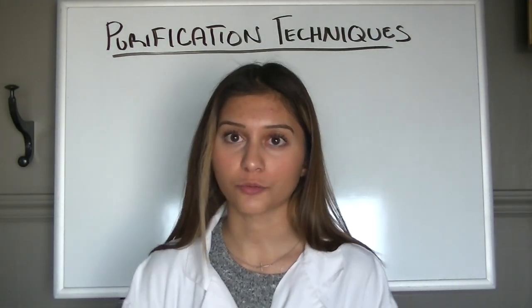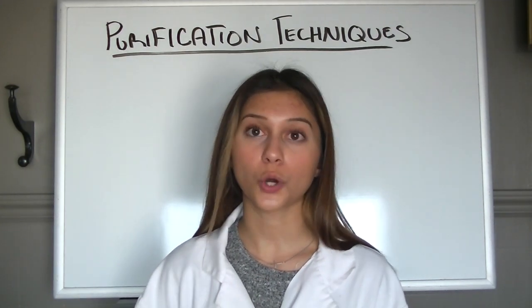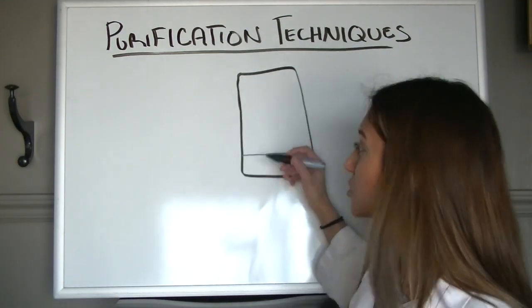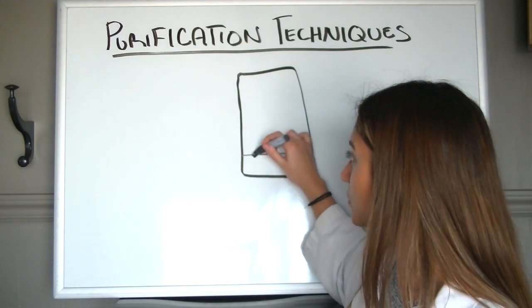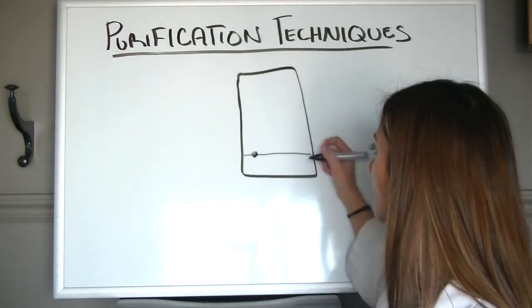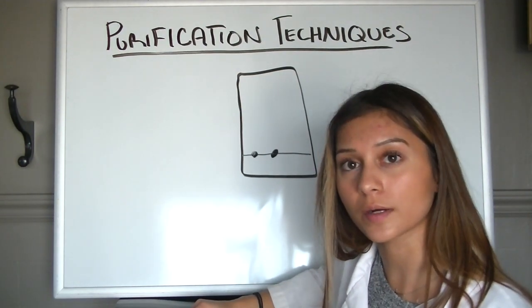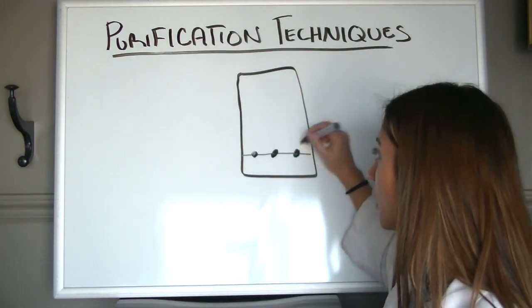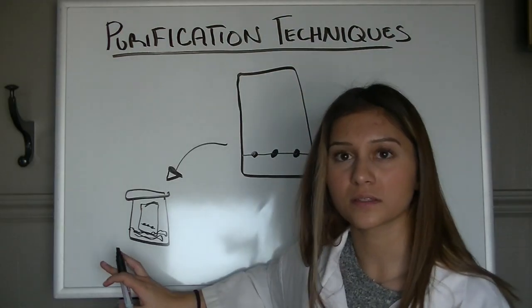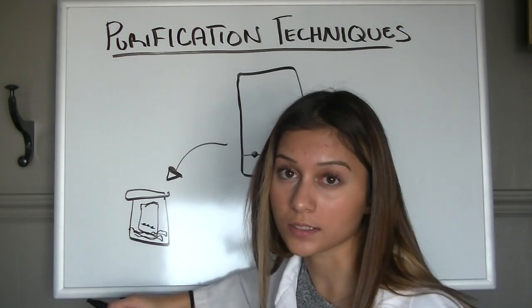Now we will look at our second chromatography, which is thin layer chromatography. The stationary phase will be the plate that is coated with the silica gel. We are then going to draw our start line on the TLC plate. A small spot of our solution of our compound will be put on one end. Next, we are also going to put a co-spot, which will consist of our solution and then another compound that we are wanting our sample spots to compare with. The plate is then going to be developed by placing it in a sealed jar that consists of an eluent such as ethyl acetate hexane.